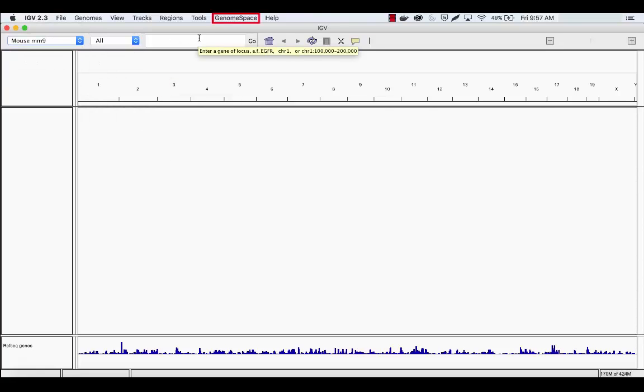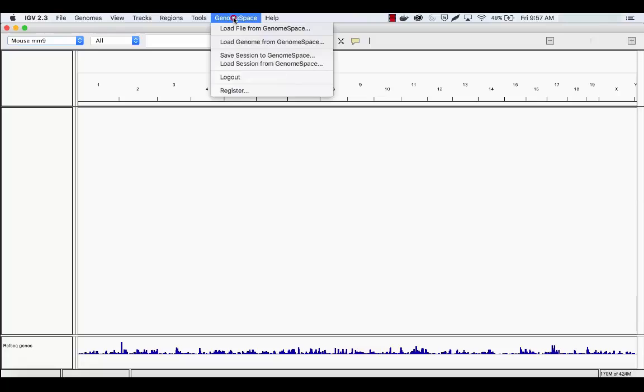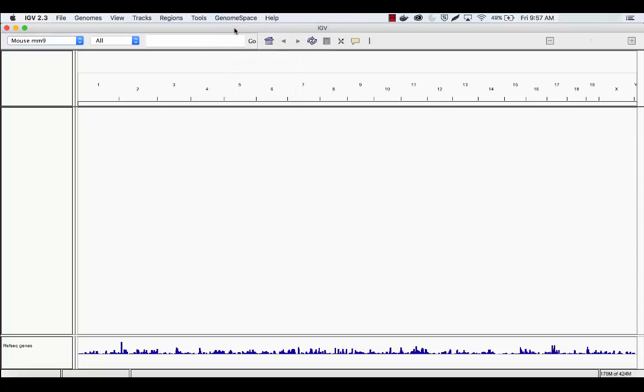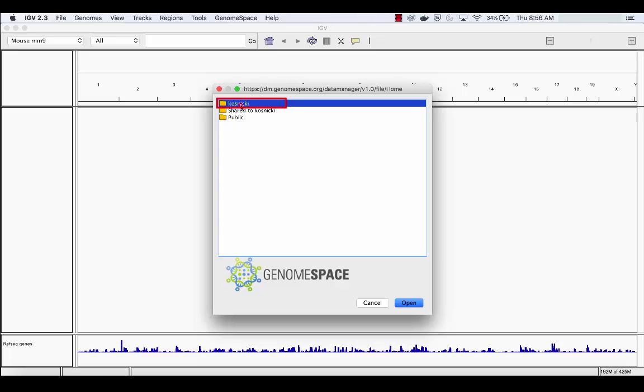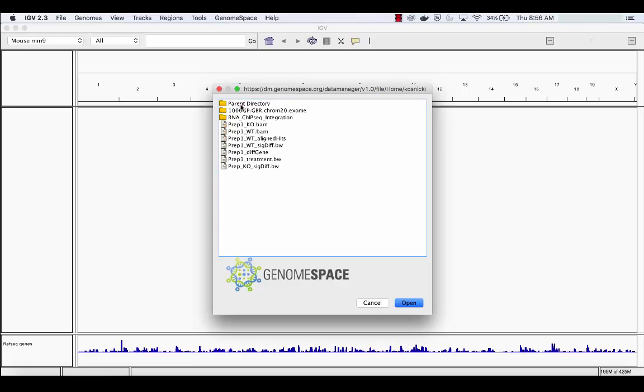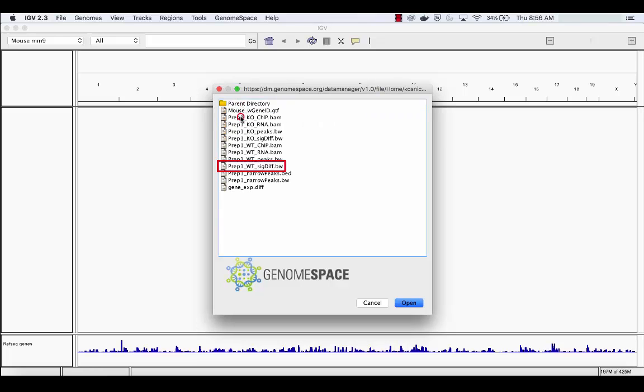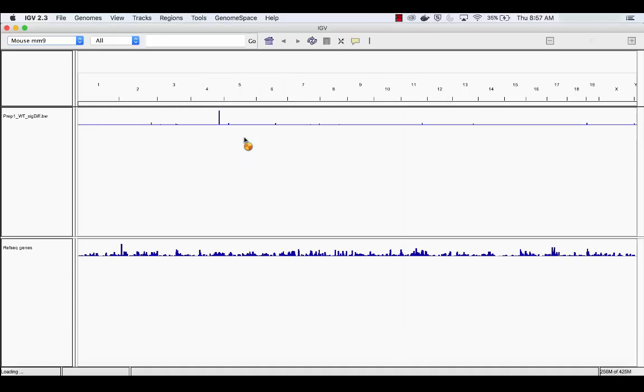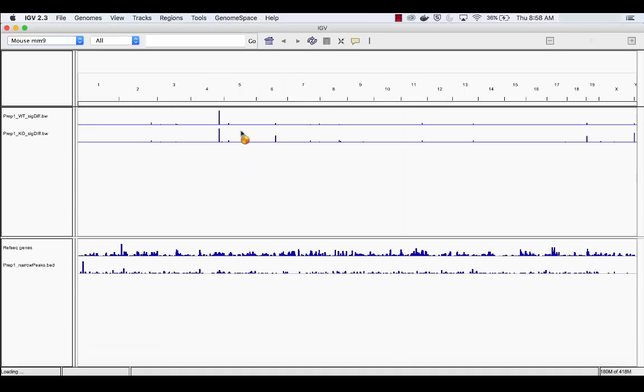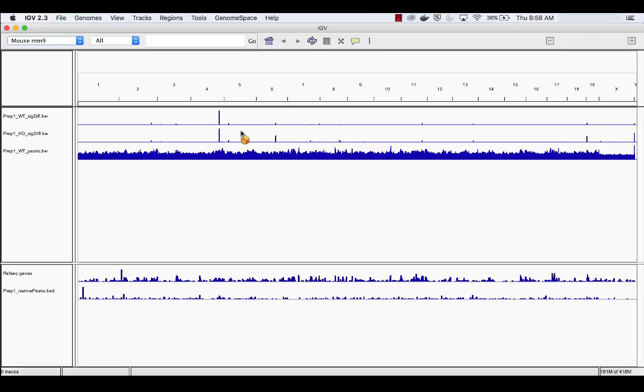To upload our files from GenomeSpace, select GenomeSpace in the toolbar, then Load File from GenomeSpace. Navigate to the appropriate folder. We will start by loading the wild-type gene expression data. Note, you will repeat these steps for the remaining files, but for the sake of this demonstration, we have skipped over these repetitive steps.